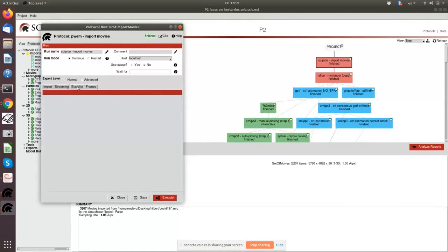And you can, for instance, remove some patterns that you know you don't want to import because they are, for instance, atlas pictures. Or there has been, for instance, a previous import that crashed, or you stopped it, and then you want to import only the new movies.